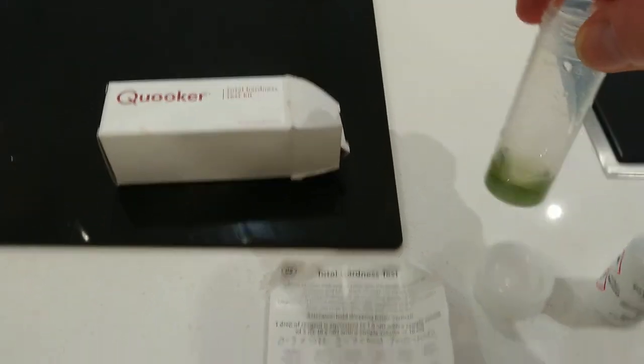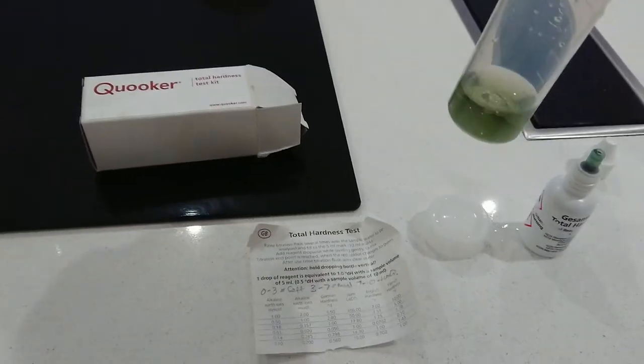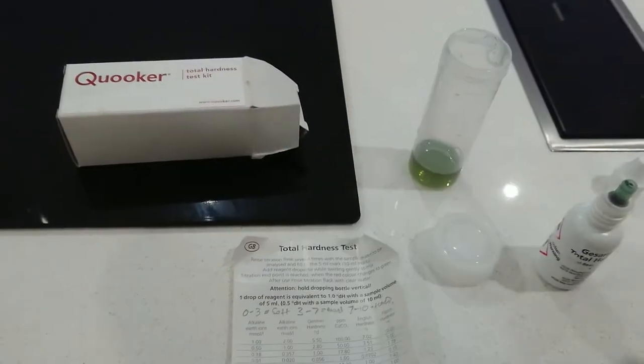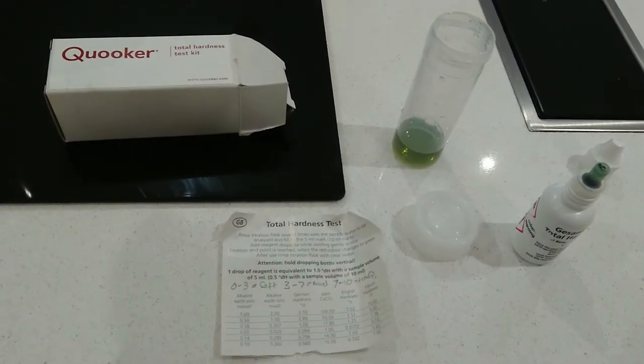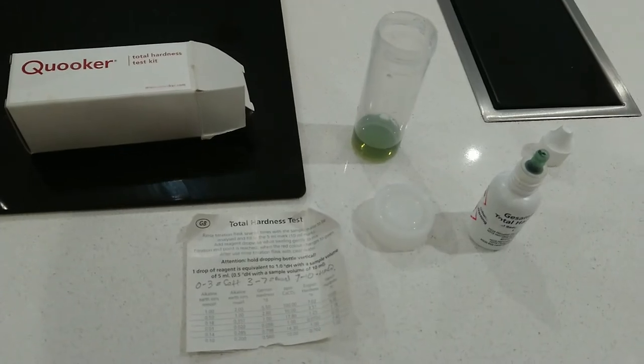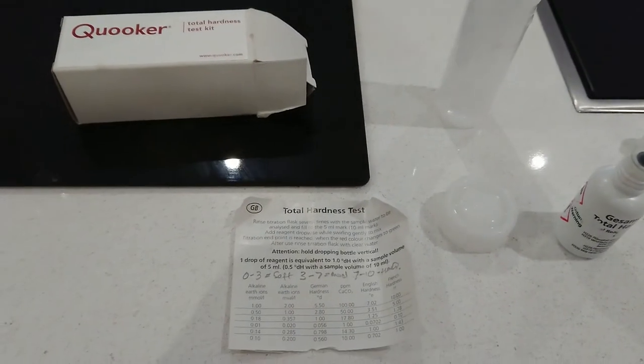Five - now I would say that's green. I've written a little summary up there: naught to three is soft, three to seven is medium. That's quite good because I've just taken that sample off our hot water supply which goes through a salted water softener.